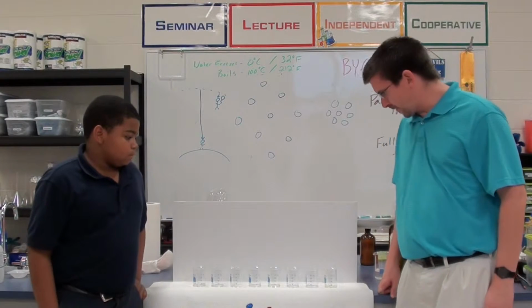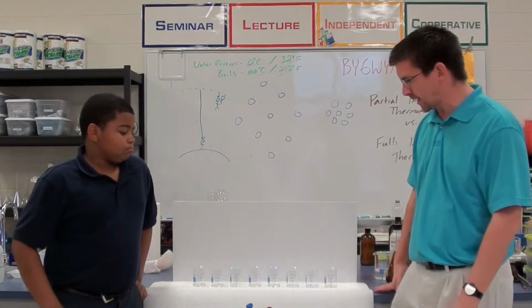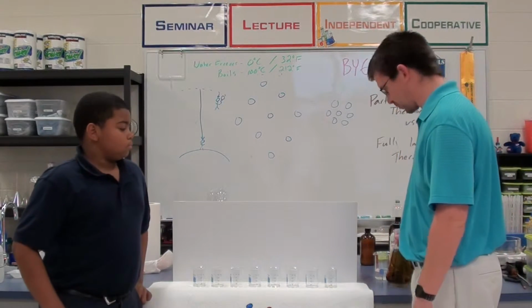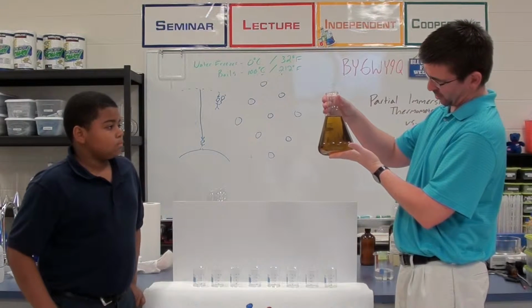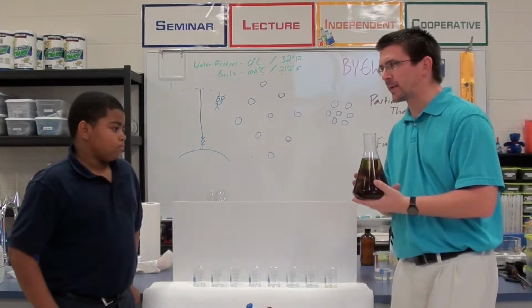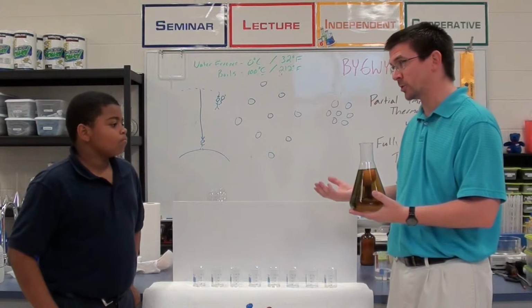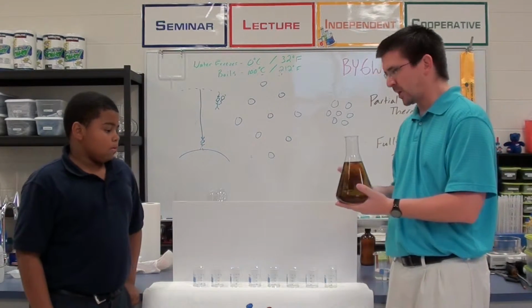Well, Cameron, we've talked a little bit about acids and bases, and we're going to do a little activity here looking at some different acids and bases using something called universal indicator. You look at this, it's kind of a brownish, not anything too exciting liquid, right? Yellowish. But universal indicator is interesting because as it comes in contact with substances with different pHs, different strengths of acids, strengths of bases, it'll change color.